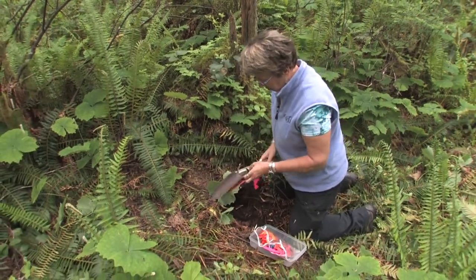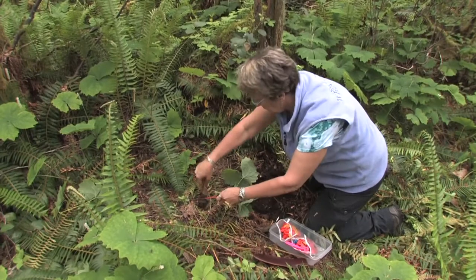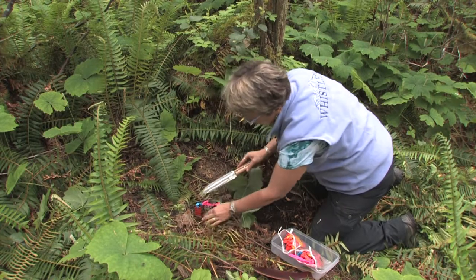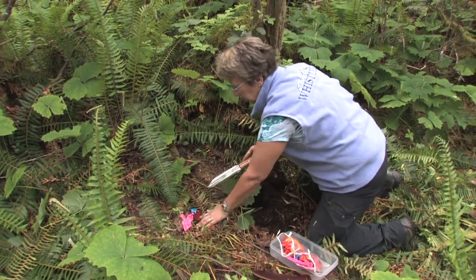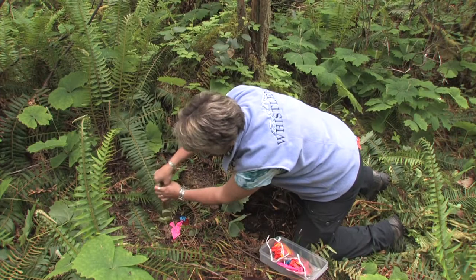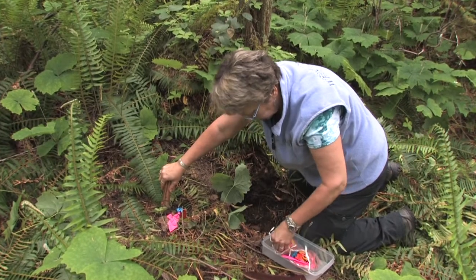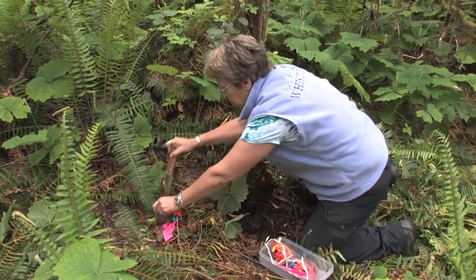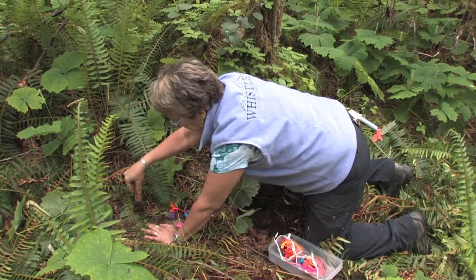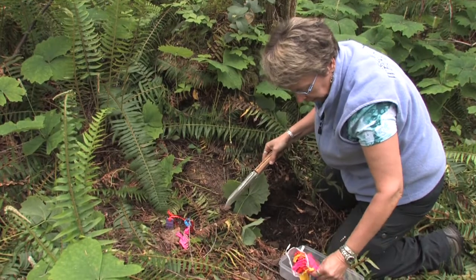We use a knife to insert the probes, which have flagging tape so when we come back to the site we'll be able to easily identify where the probes are. We usually pair an anion and a cation probe in a similar area, putting four pairs out in both the forest floor and mineral soil.